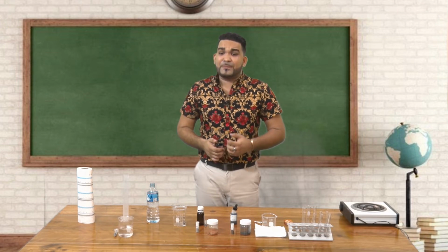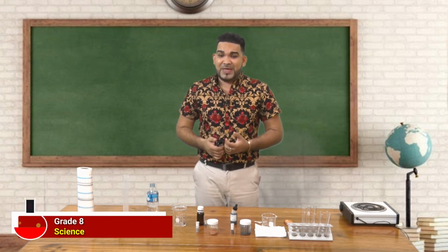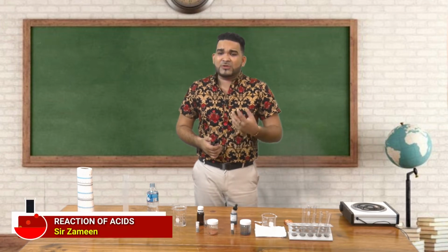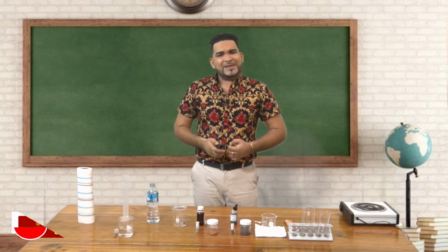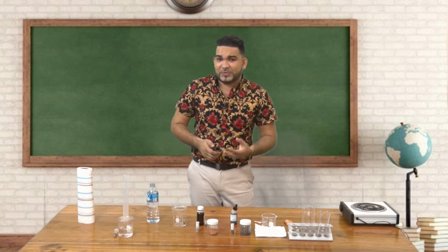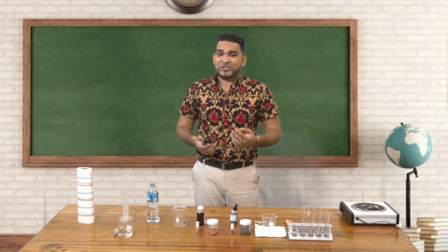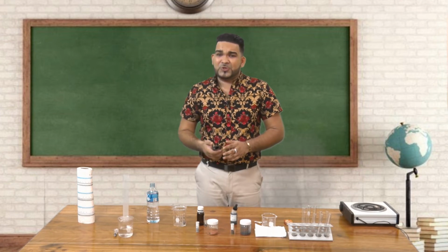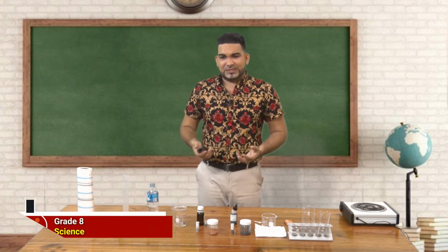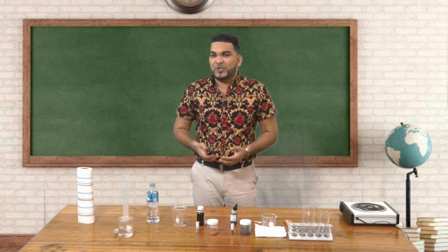These reactions are important to us since most of the materials we use are made up of or include these substances. What do you think happens when an acid reacts with a metal? Have you ever noticed what happens when acid drops on a coin or a nail? Perhaps you have observed or not, but let us do a little experiment here on what would be expected to happen.